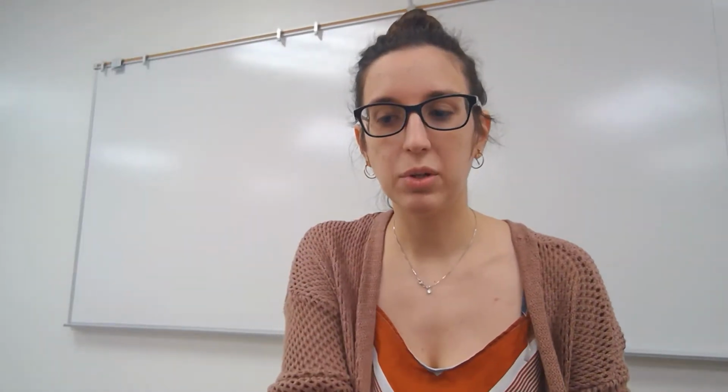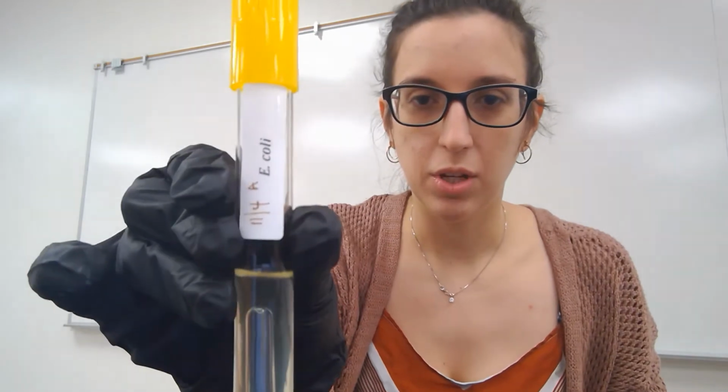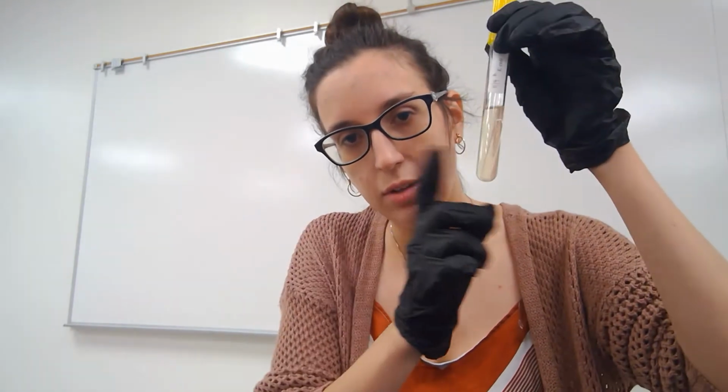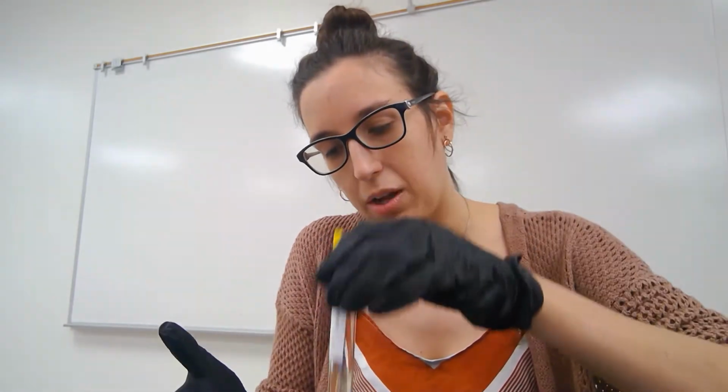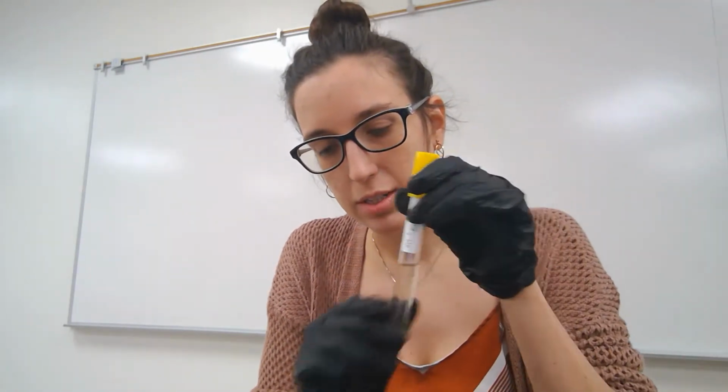So for the nitrate reduction lab, you would have inoculated E. coli. So here's E. coli. It's grown in the nitrate reduction broth, which just contains nitrate and some other nutrients, in order to act as a substrate for that enzyme nitrate reductase.